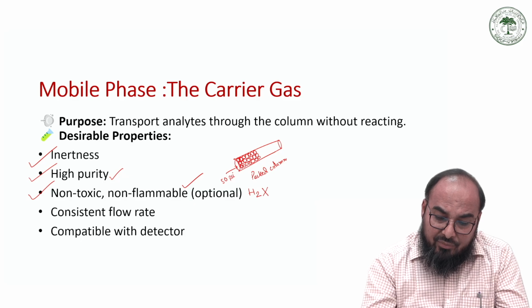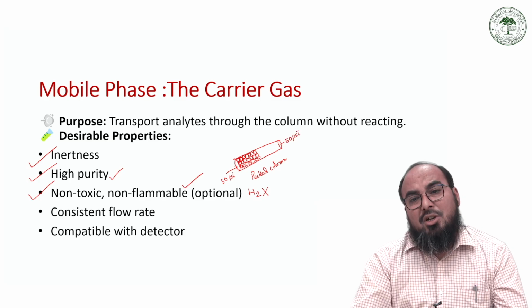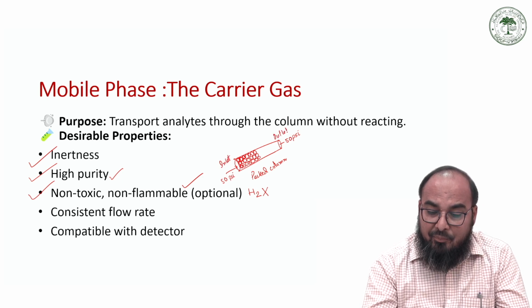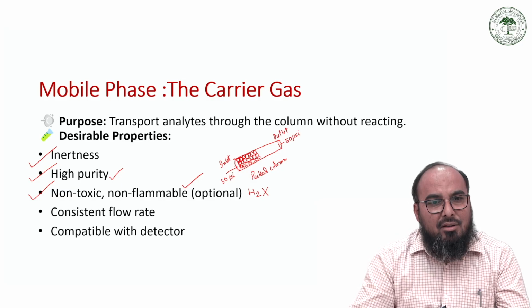So if for example you give 50 psi pressure here, then there are chances that you will get close to 50 psi pressure at the outlet. That is, the pressure at inlet must be the same as the pressure at the outlet. And this also tells you that your system is working fine, it does not have any clogging.